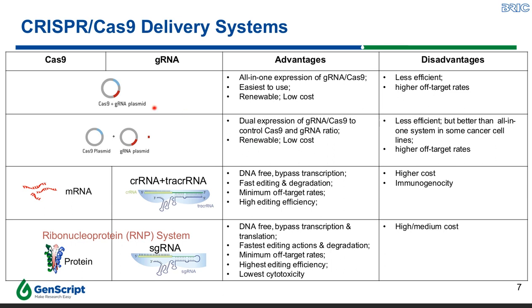The only difference between these two plasmid systems is that some of the studies show that the use of the dual plasmid system may have improved the editing efficiency and efficacy in some of the cancer cell lines.